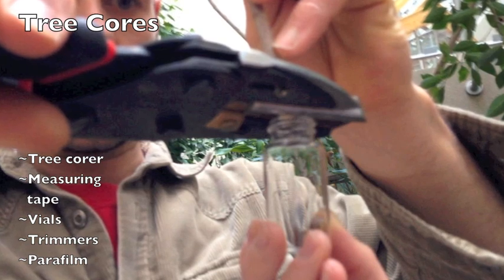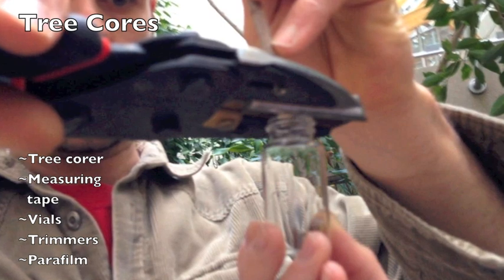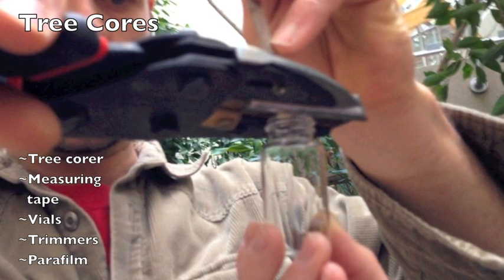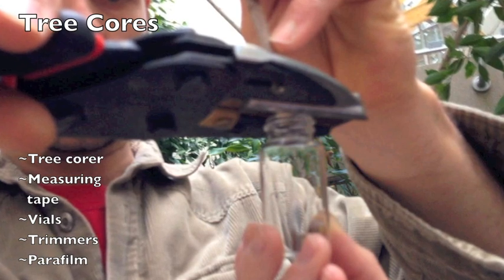Using a handheld trimmer, snip the core into small disks directly into your sample vial. Trimming the sample into small disks increases their surface area and allows for better water extraction. Cap the sample immediately and parafilm as soon as possible.